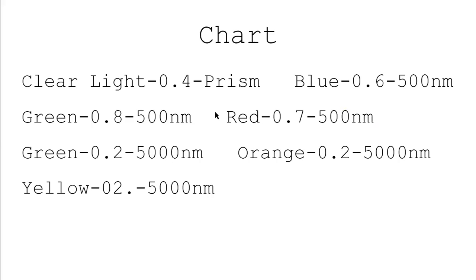Here's the example of the charts used to measure out the rays using the photoprojector. Finding the 500 nanometer lens was a stronger result than the 5,000.